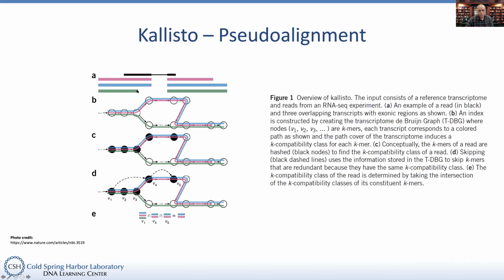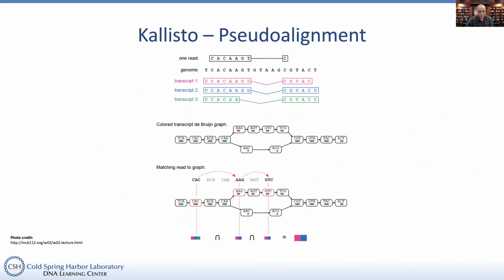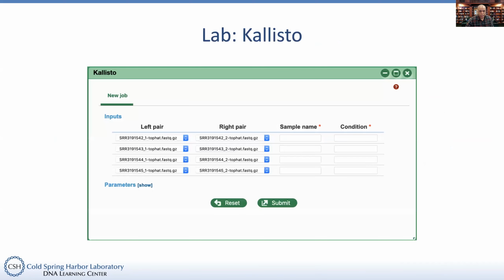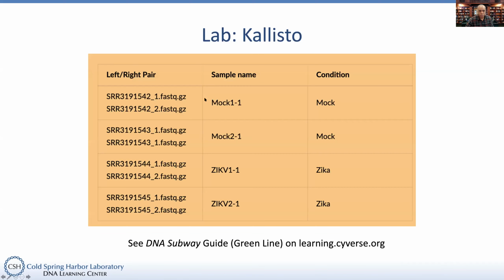And so you need to do this, but you're doing it literally for every single read. So it's an interesting thing. And then reads can map to more than one transcript nearly flawlessly. And so that's another problem, whether it's genome duplication or other things, but we don't need to go that deep. This is just another way of explaining it, that we're trying to do that mapping to figure out what's the best possible match.